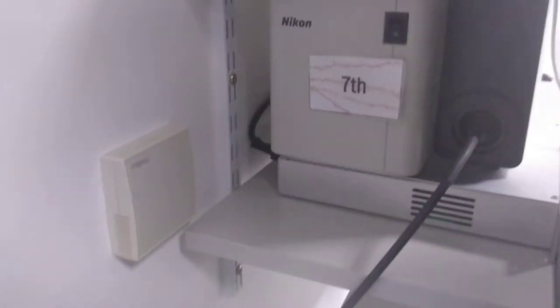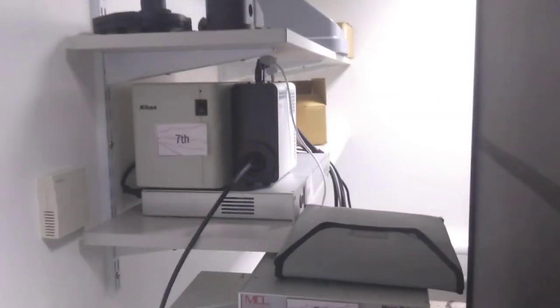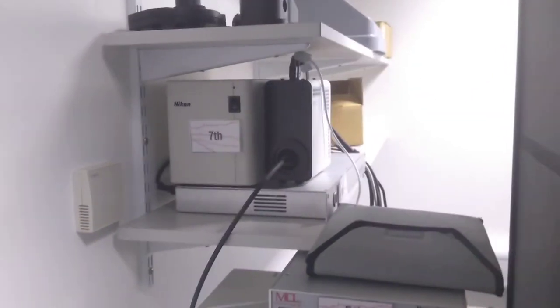After this, you can turn on the stage controller, which is the sixth switch found on the shelf above the fifth unit, and then you can wait ten seconds or so until you turn on the microscope body itself.